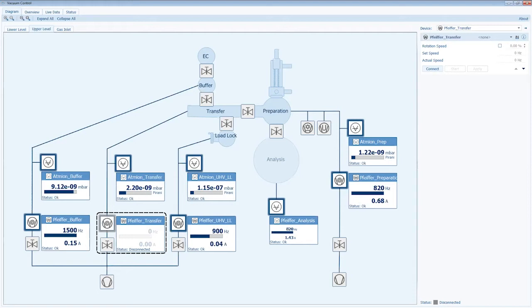It has several sub-softwares, and one is called SpecsLab Devices. In exactly that Devices software, you can change different properties of the device. So in order to change it, you should be sure what you are doing. As soon as you change something and forget it, it might stop working completely. For example, I tried to connect the pump by myself recently. It was not easy, and I did not succeed with this.